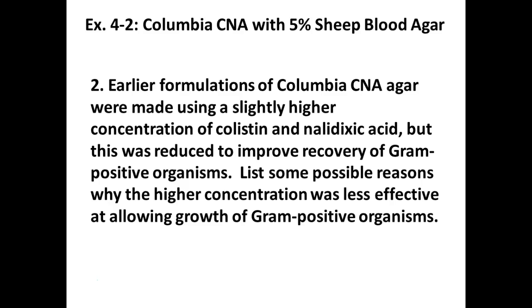So the problem here, right, lots of antibiotic. And so it was even killing off some of the gram-positives. Why would that happen? Why would a high concentration be a problem? When we did our Kirby-Bauer test, right, we talked about what is that concentration that we want.